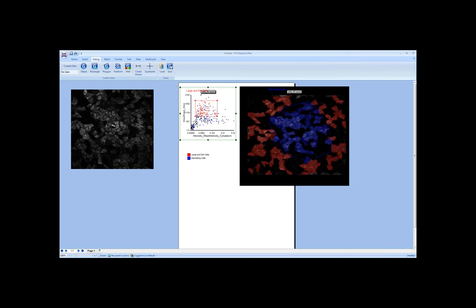Now, another thing we can do in FCS Express is start gating or thresholding through what we call hierarchical gating. Hierarchical gating means that we can look at populations and subpopulations of subpopulations, all sorts of phenotypes of different cells. So let's set that up. Let's say we only want to look at the interesting cells, the cells that appear blue here, and we want to only look at the cells that are large and dim within that interesting cell population.